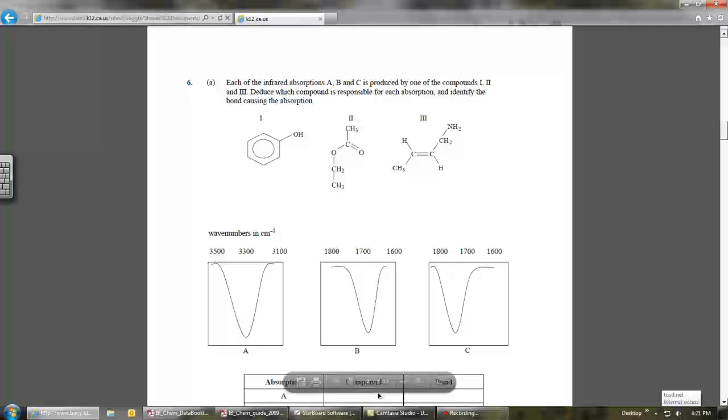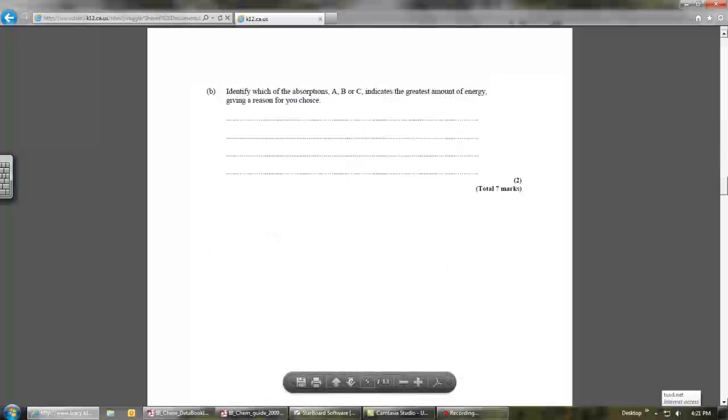Let me see if I can find a better example of an infrared spec. There you go. So here's the entire thing. Now, let me give you guys some advice. This section over here is where you're going to see unique peaks. You can see one here at about 3,000. So this is the area to look for obvious peaks. This area is known as the fingerprint region. And the reason it's called that is because it's very difficult to identify a specific functional group here.